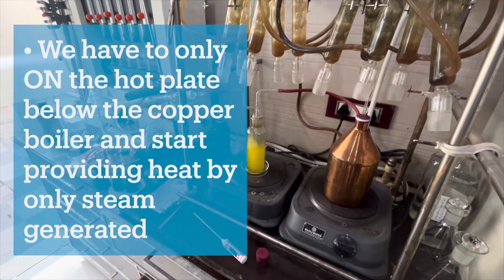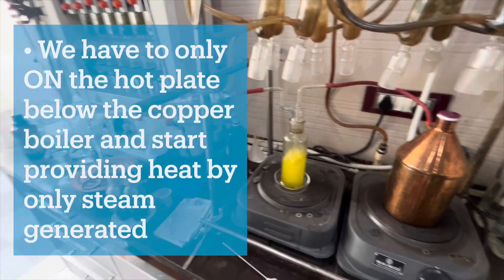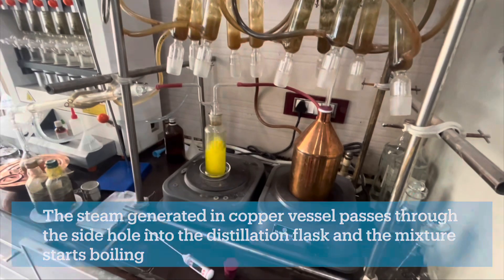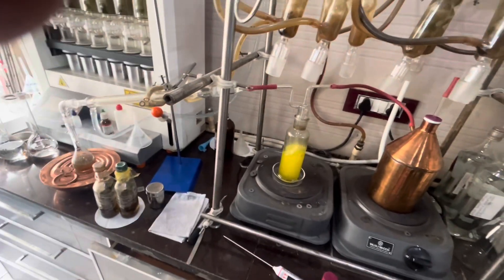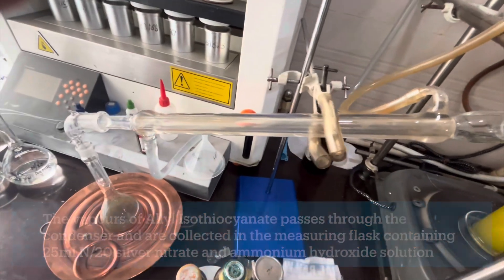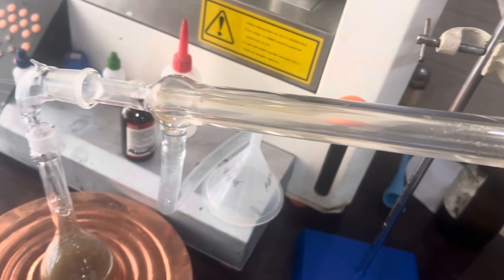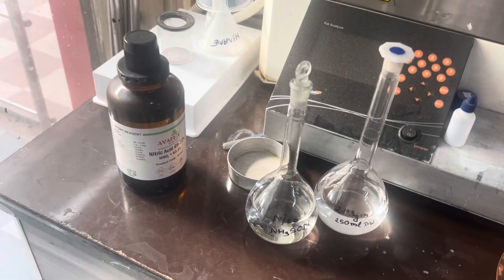After completing the steam distillation apparatus setup, start providing heat through a hot plate to the copper vessel containing water at a level not more than two-thirds of its volume. The steam generated in the boiler passes through the side hole into the distillation flask and the mixture starts boiling. The vapors of allyl isothiocyanate pass through the condenser and are collected in the receiving flask containing 25 ml of silver nitrate and 10 ml of ammonium hydroxide solution. After collecting 150 ml of the distillate, immediately remove the receiving flask and close with a stopper.